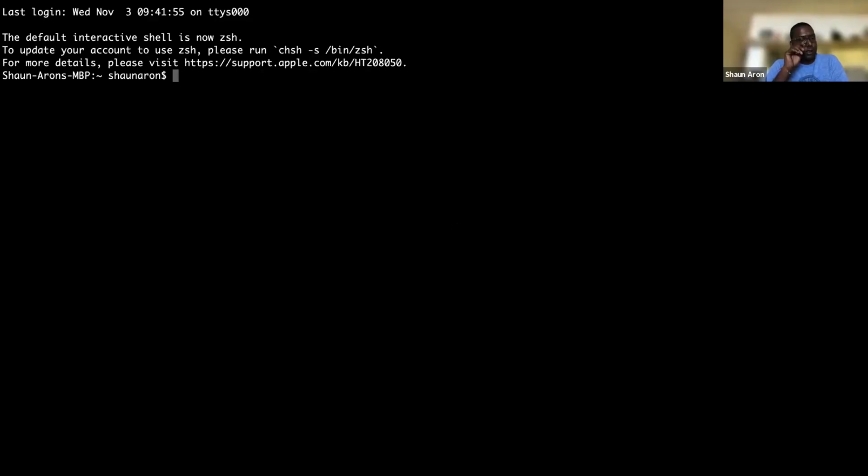So I've opened up another terminal on my computer, right? So you'll see now I'm currently on my computer. And now what I'm going to do is copy those files from the terminal, from the cluster that I'm working on, to my computer. Okay. And the way that I'm going to do it is I'm going to use SCP.